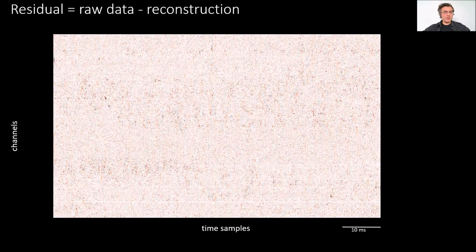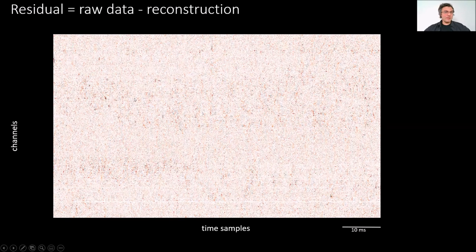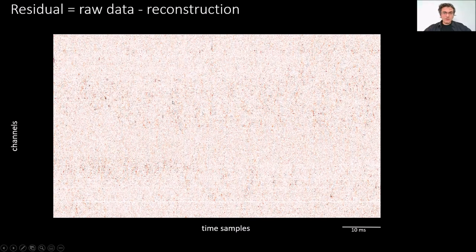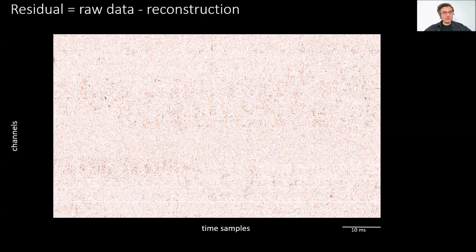You'll also be able to see the residual of the reconstruction — what's left when you subtract the reconstruction from the raw data. This is useful for picking out when the algorithm doesn't work so well: it might leave stuff in this residual that you could identify as spikes from neurons that weren't captured. In the GUI, you'll be able to zoom in and look more closely at individual events to see exactly how the subtraction worked.